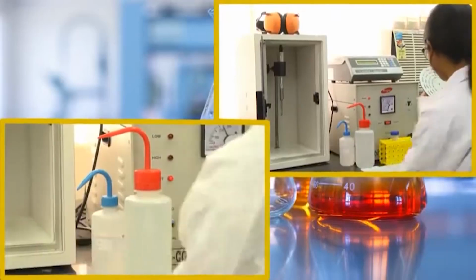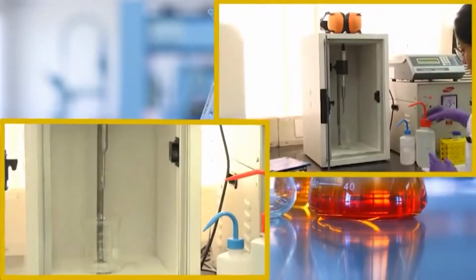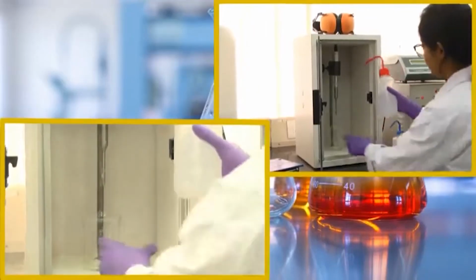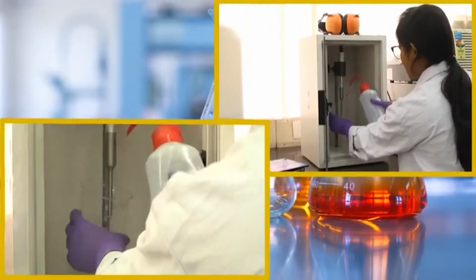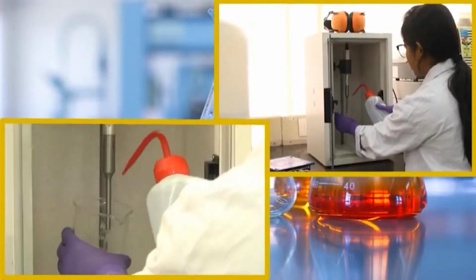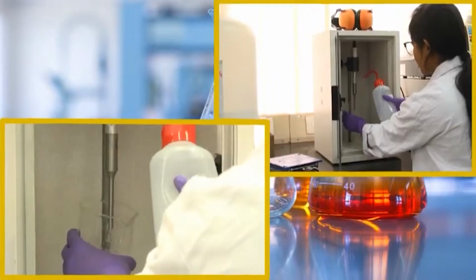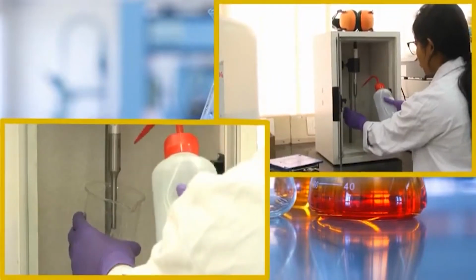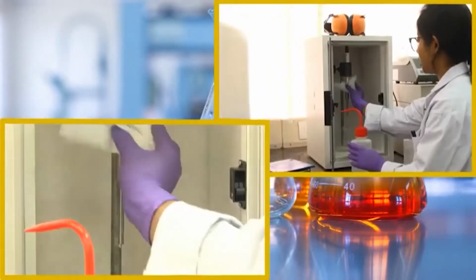But before we do that, we need to follow some good lab practice, and we will clean up the probe. First we will clean it with normal deionized water. The solution gets stuck to the probe. It is always good for the long storage of this probe to clean it, otherwise there might be some rust.